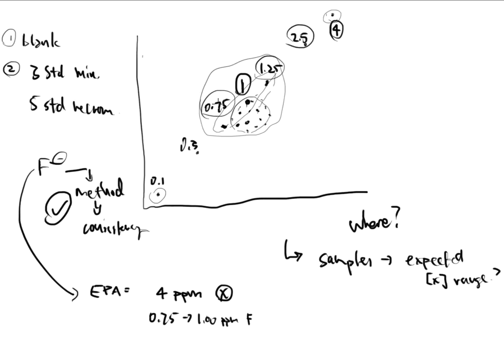This is the proper generation of a calibration curve. It doesn't have to be symmetrical. It doesn't have to be even. It doesn't have to be distributed the same way from standard 1 to standard 5. Not only that, but they don't have to be whole numbers, right? They can be random weird little numbers like 0.1 or 2.5. It doesn't have to be nice rounded numbers like 1, 2, 4, 6, 8, 10, 20, 50. No one said that had to be the case.